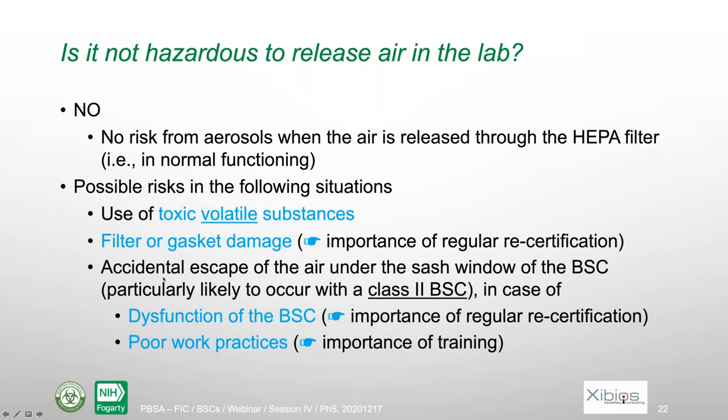And then you can also have some accidental escape of the air under the sash window of the biosafety cabinet. That's particularly true with a class two biosafety cabinet, because that protection is much more sensitive. There can be two main reasons for that. First is the biosafety cabinet not functioning properly, and again, this stresses the importance of regular, frequent recertification. And the other reason is poor work practice, and that stresses the importance of training, including practical training.